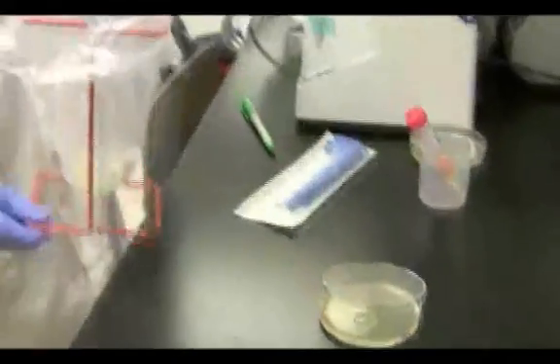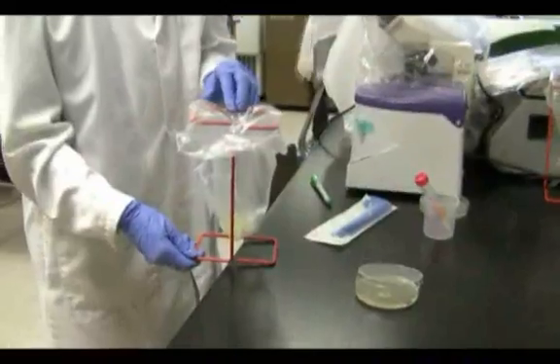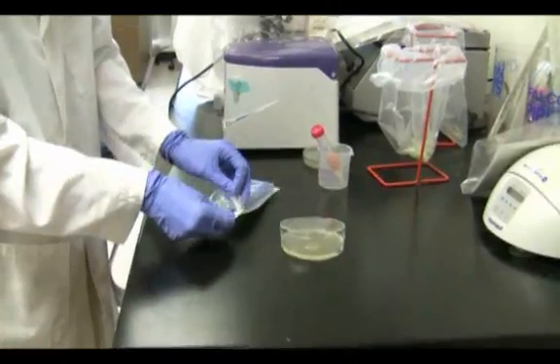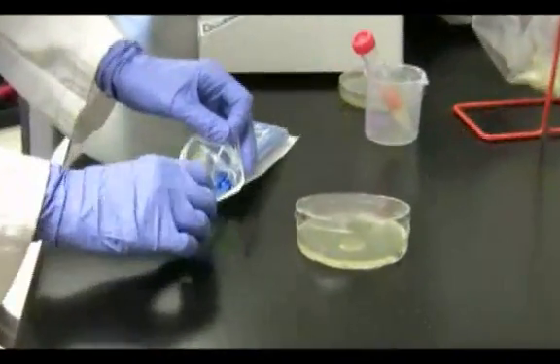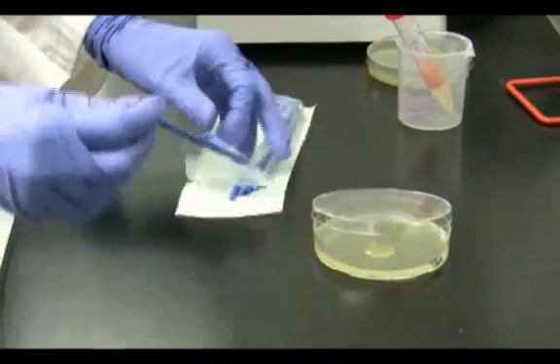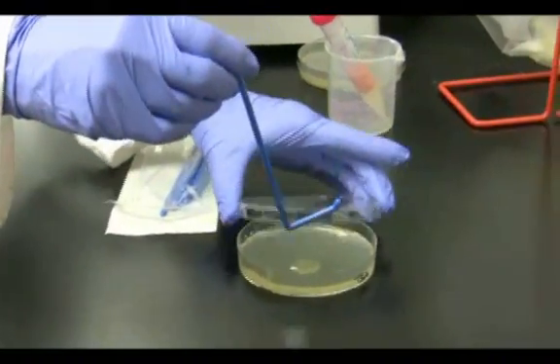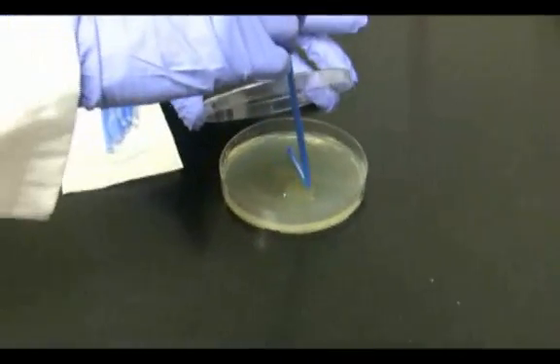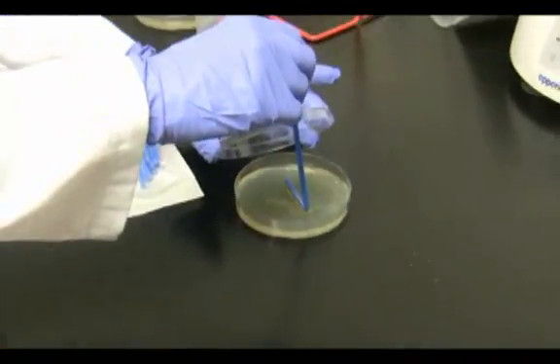Discard contaminated material in the biohazard bag. Remove a sterile spreader from its packet. Opening the lid at an angle, place the sterile spreader gently on top of the agar and swirl.